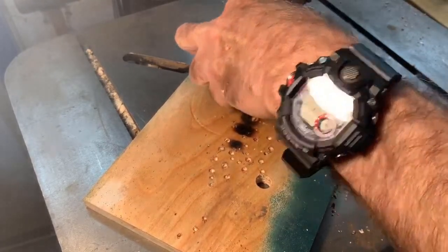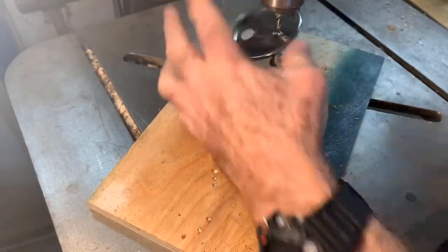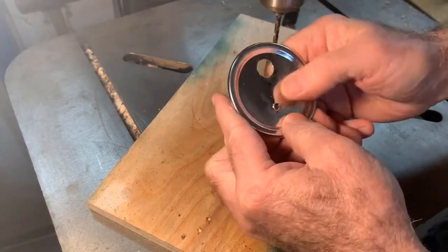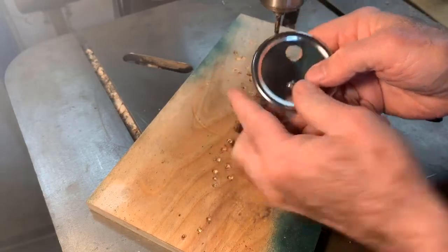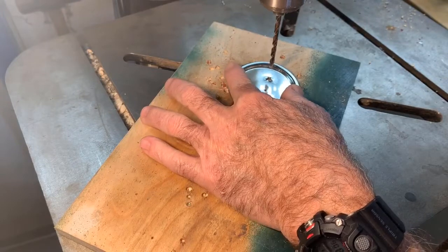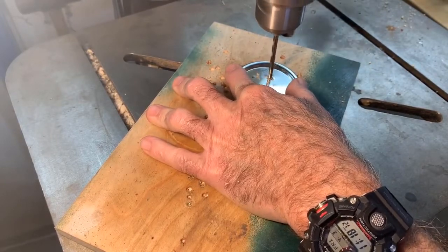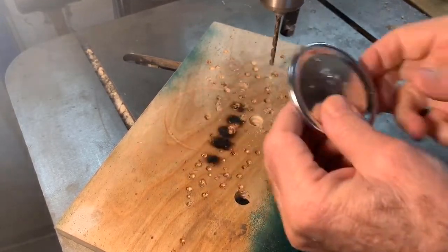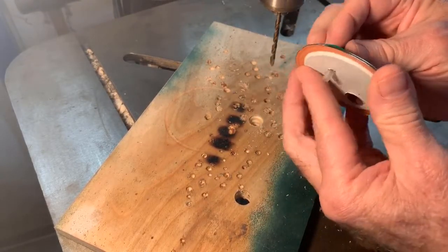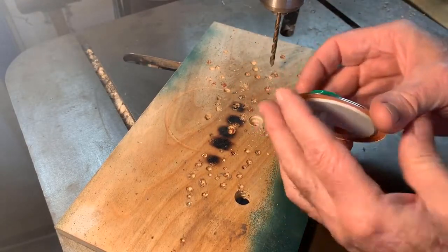That's a classic problem — when you drill, you should always clamp your work down. Sorry about that. I probably buggered that up pretty good, but it'll still work. So I flattened out the lifted metal. Let's see if I can do that again. That will be fine, because we're going to RTV this guy on there.